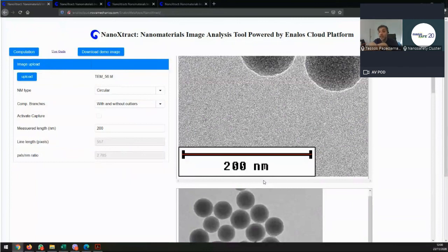You cannot do the data analysis offline, so you need to do it online. You can access the tool either directly through the URL that we showed here, or through the Nova or through the NanoCommons knowledge base by uploading the image and pushing it there. If you want to analyze four images separately, then yes, you would need to download the results and merge them and then do the averages. But we will implement in the NanoCommons knowledge base a function so that you gather the results from all the images, and then you would be able to get an average from all the images.